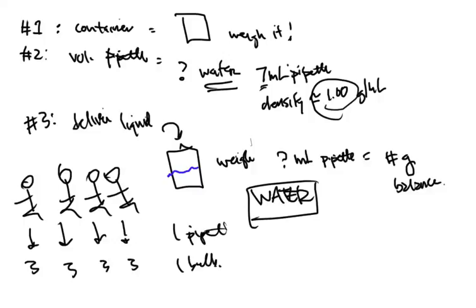So it's a race against the clock. Well, 4 times 3, that's 12 samples, and you've got to be able to do that in 30 minutes. So if you're taking longer than 2 minutes to pipette a volume, then you need to practice on the volumetric pipette because you will not get finished. All right? So that is event number one.